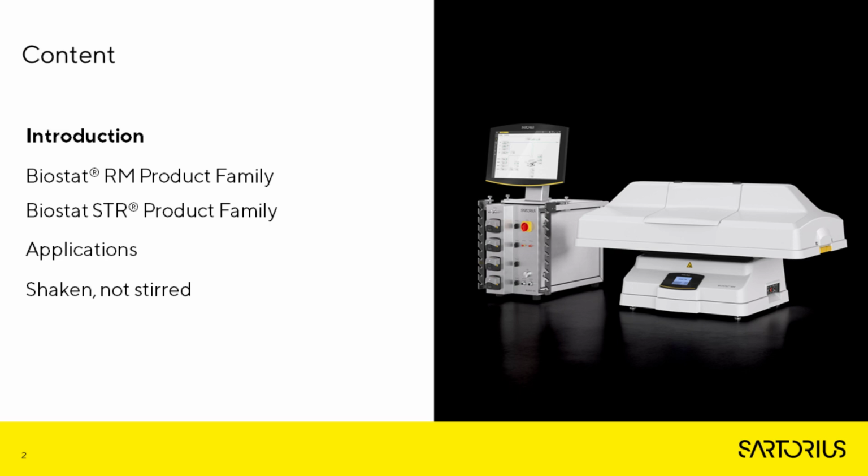So first, I will provide a quick introduction into both methodologies. I will introduce briefly only the Biostat RM rocking motion product family so that you know what it consists of, what it needs, and which parameters you can control. Same is true for our stirred bioreactor product family. And then I will talk about application data points to prove what is better for rocking motion, what are their applications and data, and what is better for STR. And then at the end, I will summarize this on the slide Shaken, Not Stirred.